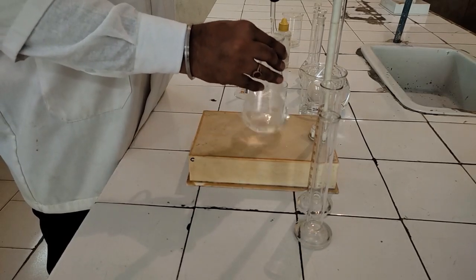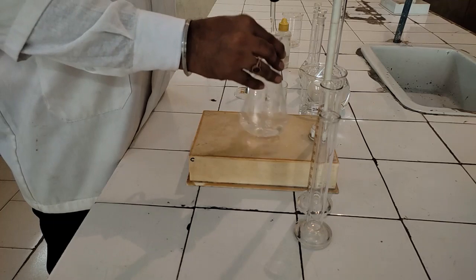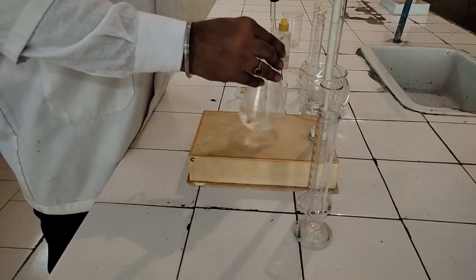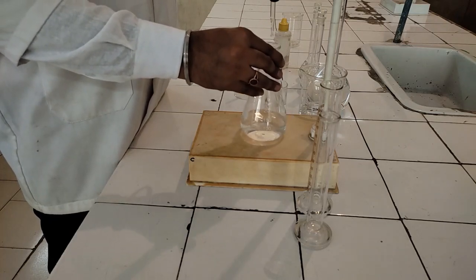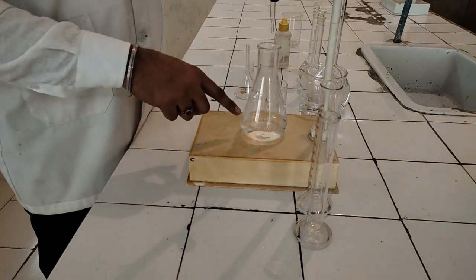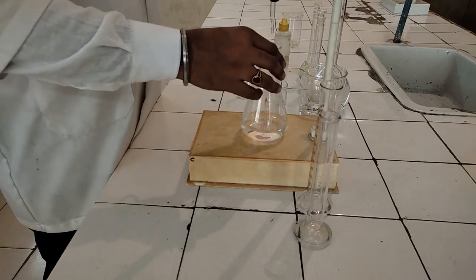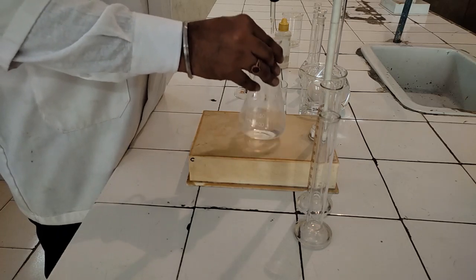As you can see, a faint color is developing, but this color must sustain for 20 seconds. That will mark the end point of our titration. You can see a small color developing in the titration when a drop falls, but this color must stay for 20 seconds.